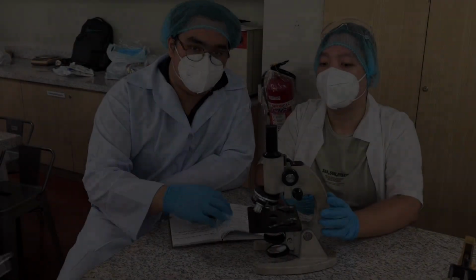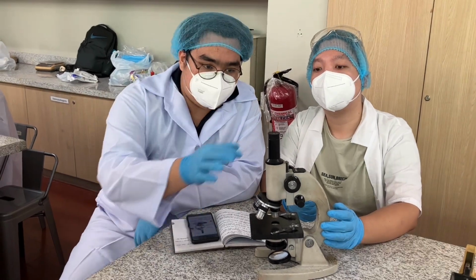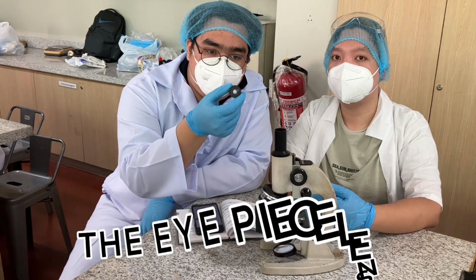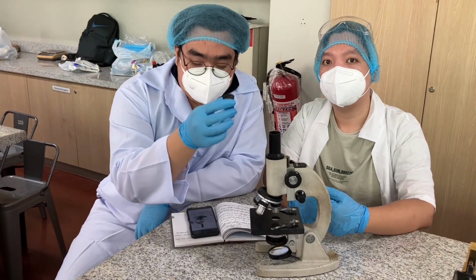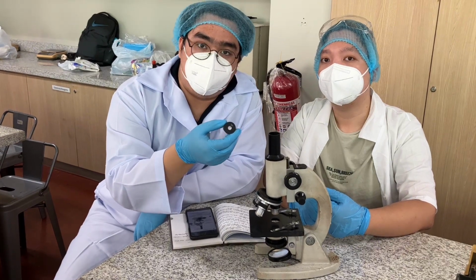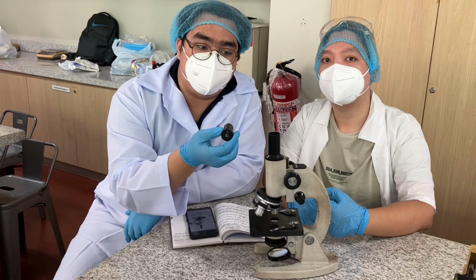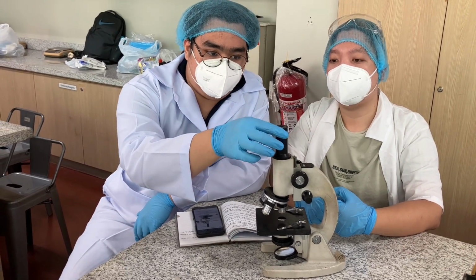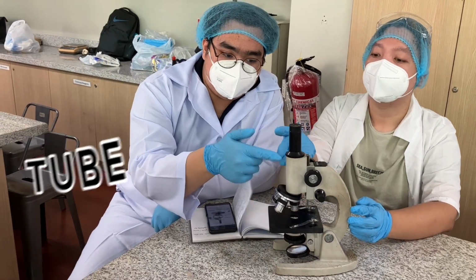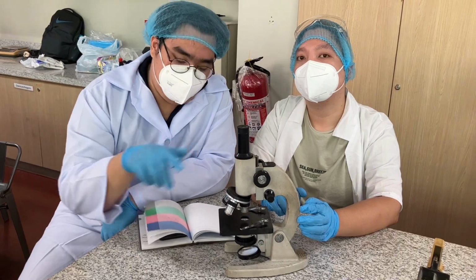Now, the first part of the microscope after the large components is this. This thing right here is called the eyepiece lens. And its main function is to provide a specific magnification when observing our specimen. It is completely removable, so it can adjust in any magnification you want. Slides right here easily. Now, this thing is the tube. This is like the neck of the microscope, and this is where some of the components can be found.